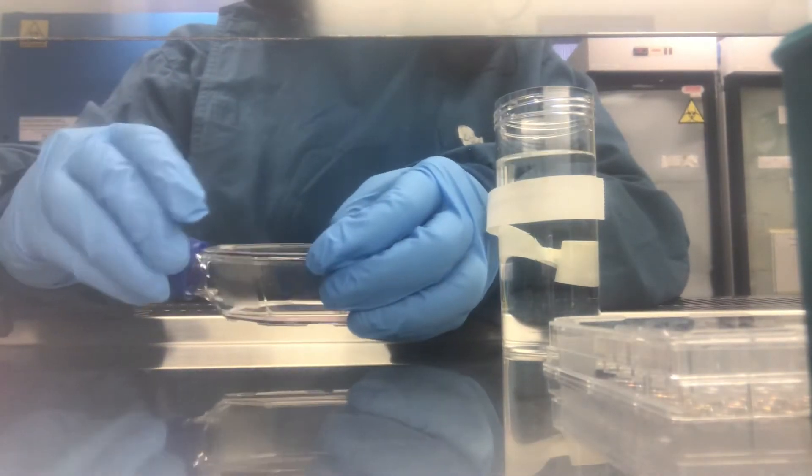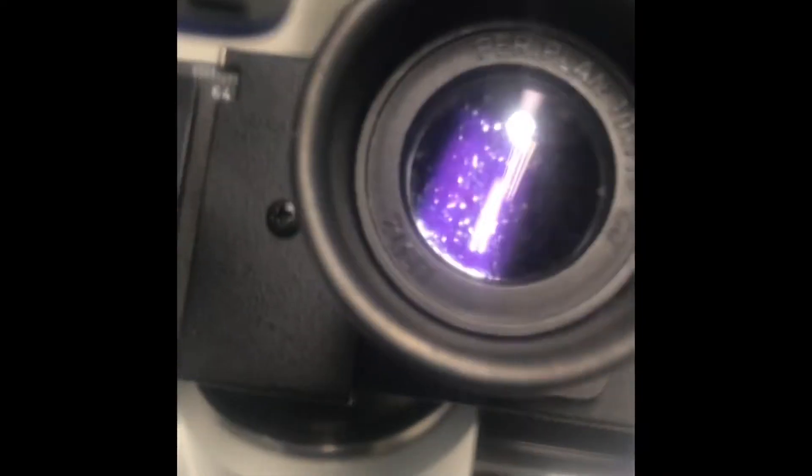Now we're gonna incubate at 37 degrees centigrade and five percent carbon dioxide incubator for around one minute. These incubation times differ according to your cells. I'm trying to view on the microscope but I cannot get the focus.